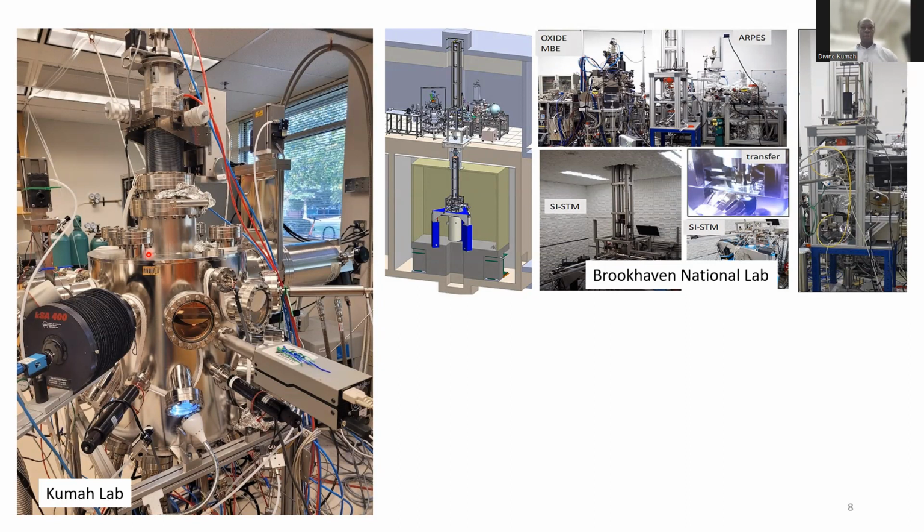There are other tools. You might go into an MBE lab and see not just a single system, but a whole array of systems hooked up to each other. In a lot of cases, these complementary systems allow you to characterize the material you're growing. For example, the system here at Brookhaven National Lab, the MBE system itself is this system right here.